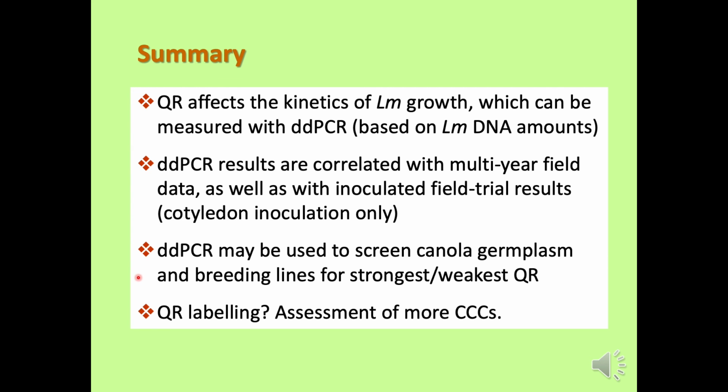These ddPCR data are well correlated with the multi-year field results for blackleg resistance, as well as to the inoculated field trial results, specifically for quantitative resistance assessment.